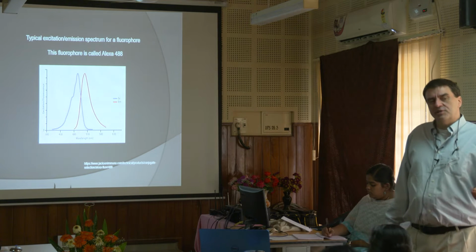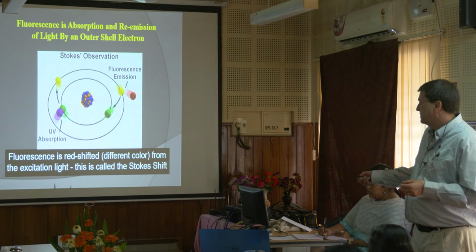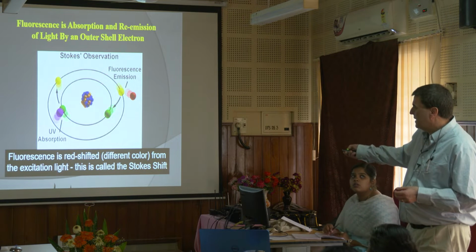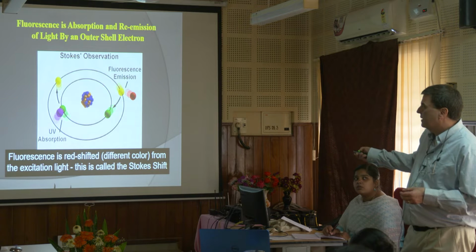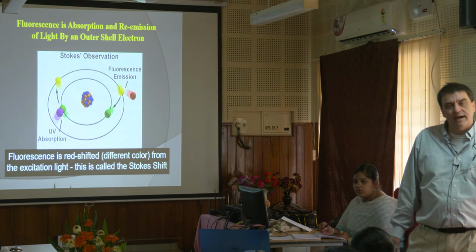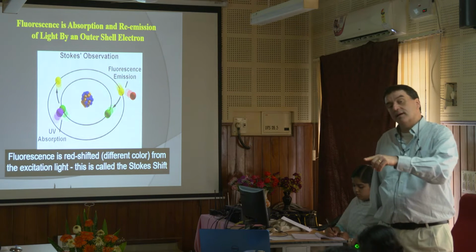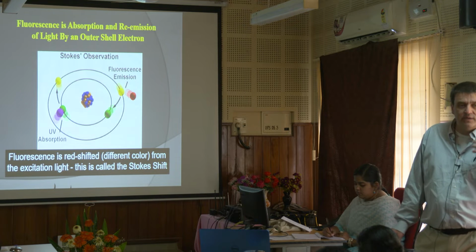And what I mean by bleach is, when we go back a couple slides, this ability to be pushed out to the outer shell and come back and fluoresce, this happens again and again and again. With Alexa, it can happen again and again, and it won't fade. But the older dyes that some of us here probably have used or you've seen in your labs might be called FITC, fluorescein isothiocyanate. Again, a green dye. But that's, like when I did my PhD, that's what we used.